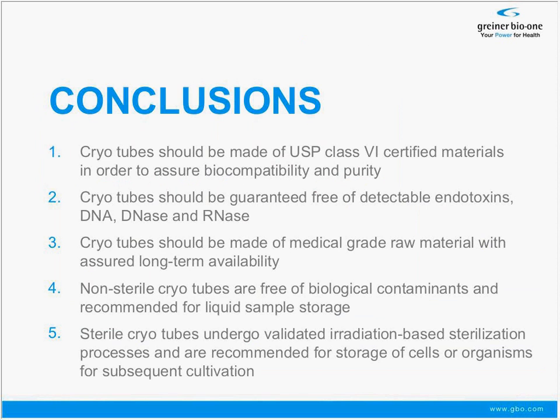I want to summarize this part of my presentation, which was dealing with the raw material cleanliness and also types of contaminants. Cryotubes should be made of USP Class 6 certified materials in order to assure biocompatibility and purity. Cryotubes should be guaranteed free of endotoxins, DNA, DNases, and RNases.